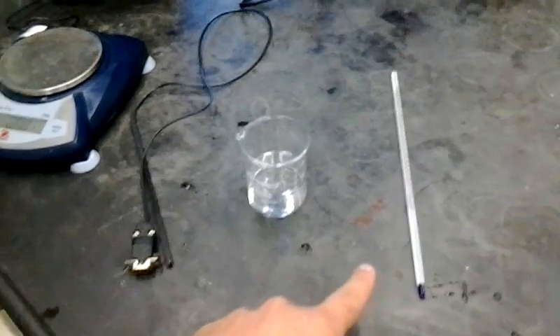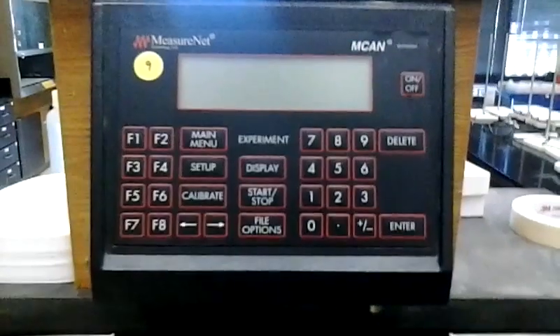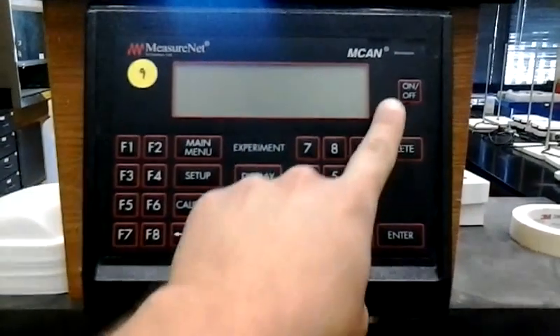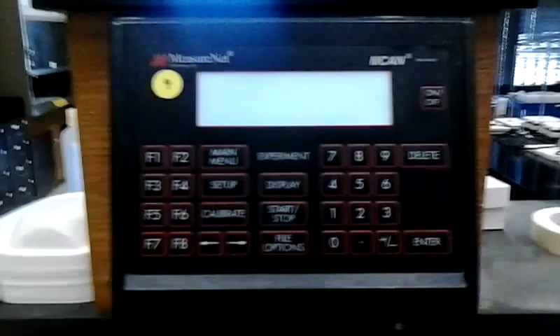So the first thing you should do is go to your MeasureNet station, which looks like this, and hit the on-off button to turn it on.